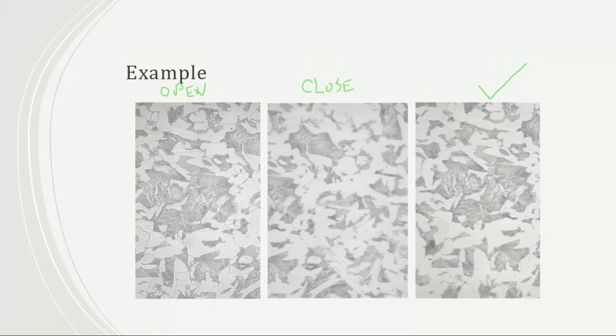Okay, because when you close the aperture, what it's going to do is it's going to kind of just blur everything out. You lose that resolution, and you can see it a lot right in this region here.